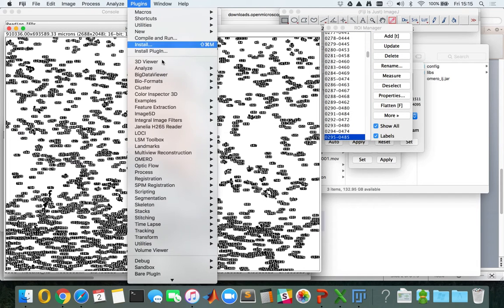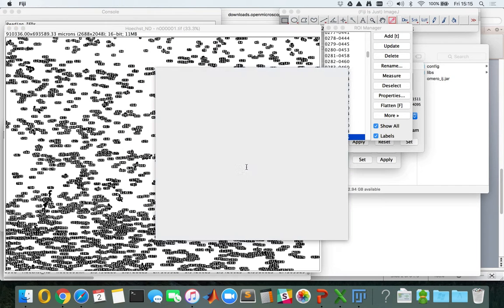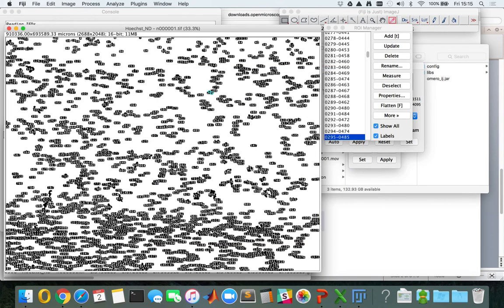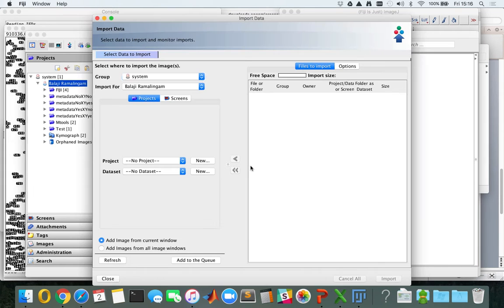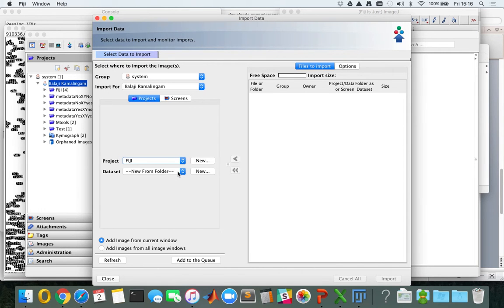Now with one single click you can send all this information back into OMERO using the OMERO plugins menu. As you can see the login screen is similar to the Insight login screen and I'm logging into Insight. In the import window you can select your project and dataset where you want to send the image to. Since this is a segmentation routine, I'm adding it to the segmentation dataset.